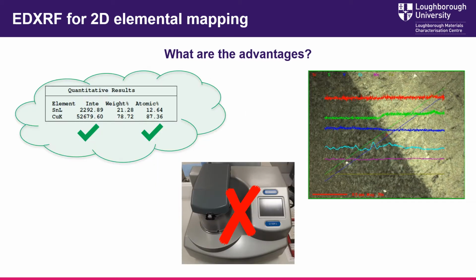2D maps can be displayed as region of X-ray intensity or weight percent. Samples require minimal or no preparation for analysis. Samples do not require conductive coatings. Effective 1D mapping is also available.